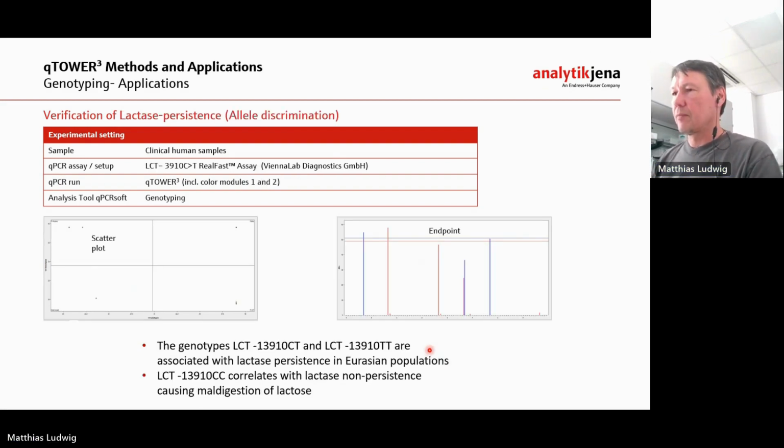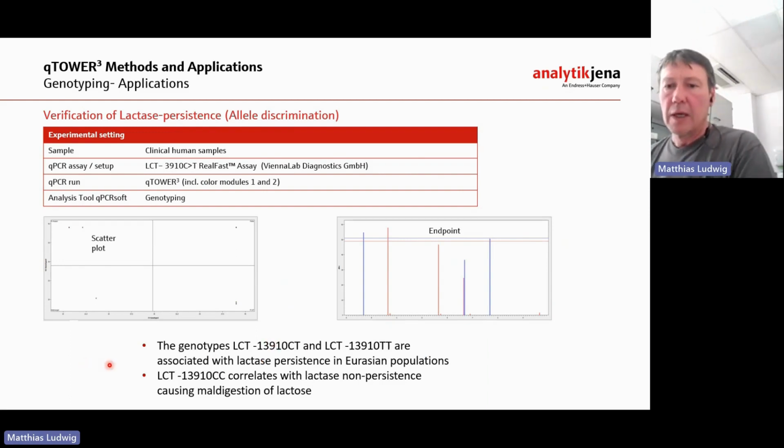The second example is also a detection assay from the same company, to detect two different genotypes for lactase persistence.